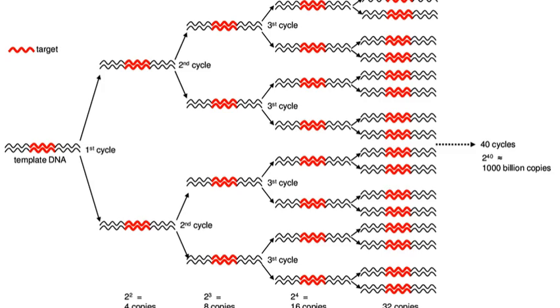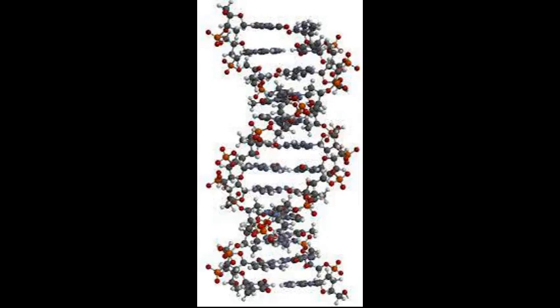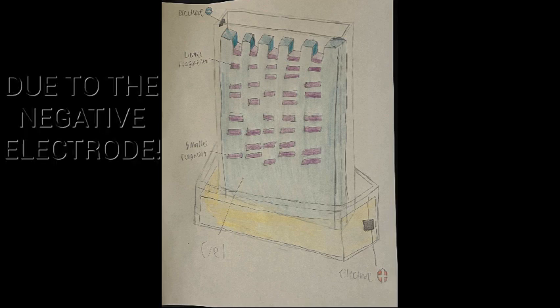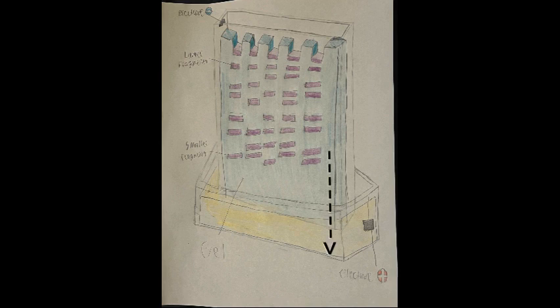After the amplification process is complete, many of the DNA molecules are all jumbled up in the mixture. The molecules are then put in a gel-like substance to be shocked. Since the DNA molecules, or nucleotides, are negatively charged, they shoot a current through the gel, and the smaller molecules will gradually make their way to the positive electrode, or the anode, which is placed on the opposite side, while the larger DNA molecules are not affected as much, because of their larger mass, making them not move as far or not at all.